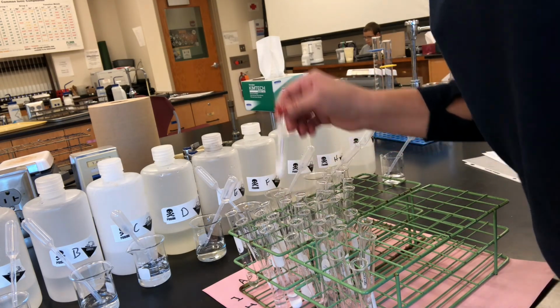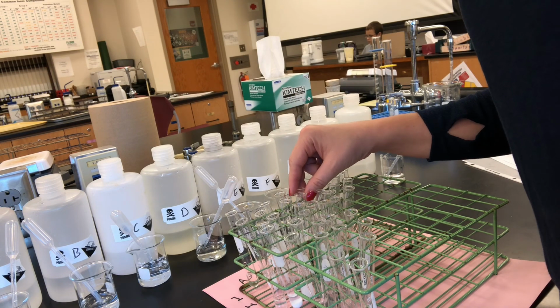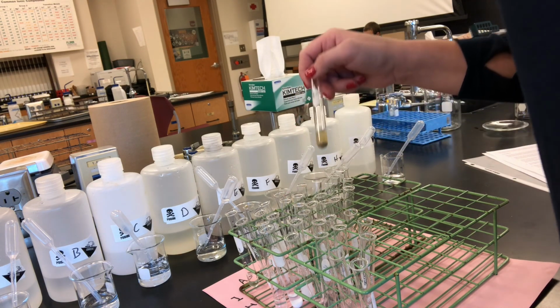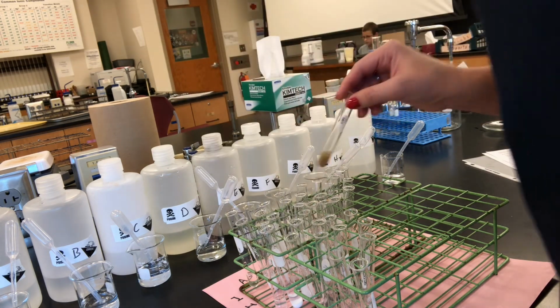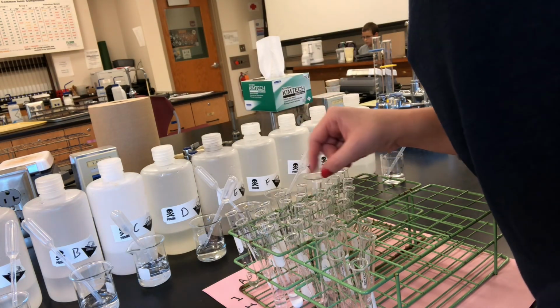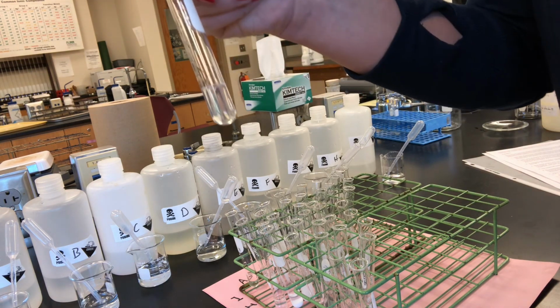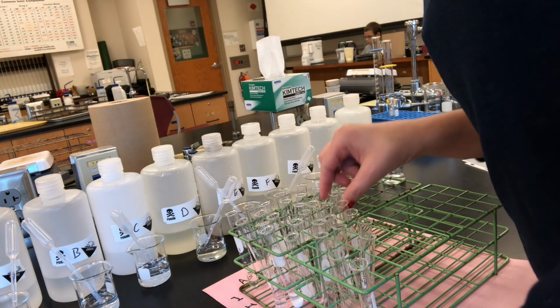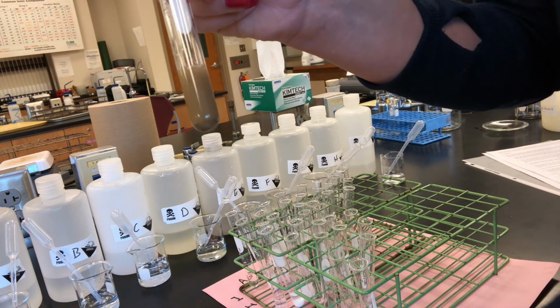E and I, milky white precipitate. E and H, this one was that orangish brown one. E and G, no change. E and F, brown precipitate.